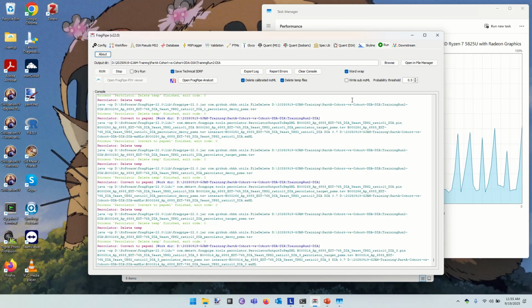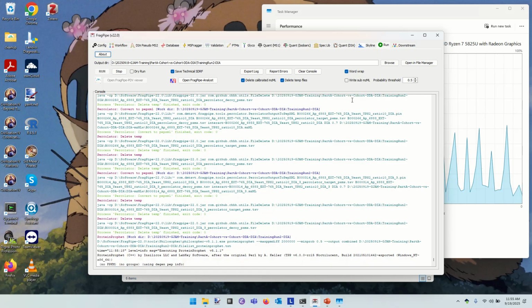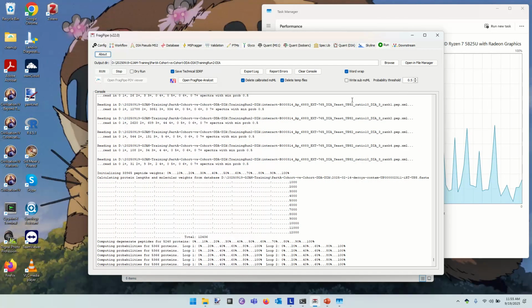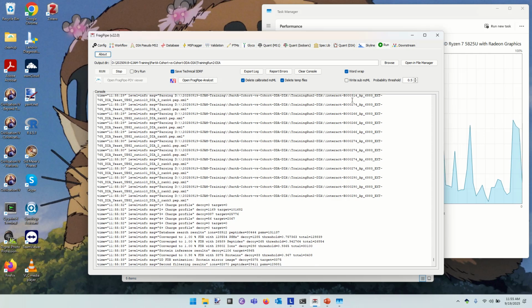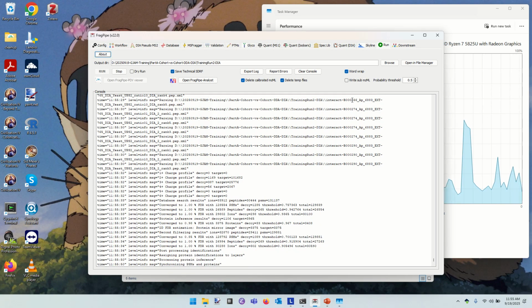All right, so I'm going to mention one more thing that's probably useful to everyone on this. How would you judge that the quantification system was working? I would say one of the simplest things to do is to shoot the same sample a bunch of times. Maybe you shoot them even on different days, because instruments have different opinions on different days. Seriously, they really do. So if you shoot just a bunch of yeast guts on the instrument, time and time again, shoot 10 replicates of the thing, you can then ask, what is the coefficient of variation that I see for measurements of this protein over time?